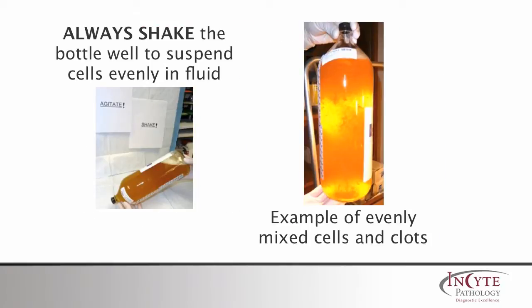It is important to turn the bottle upside down and shake well. The picture on the right shows what a bottle with evenly mixed cells and fiber and clots looks like.